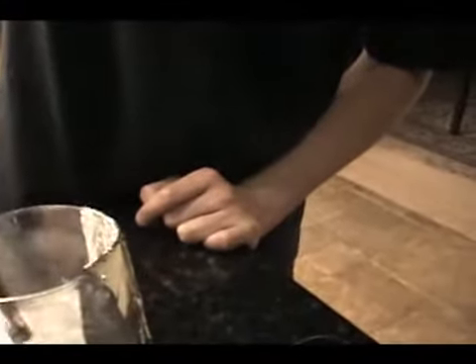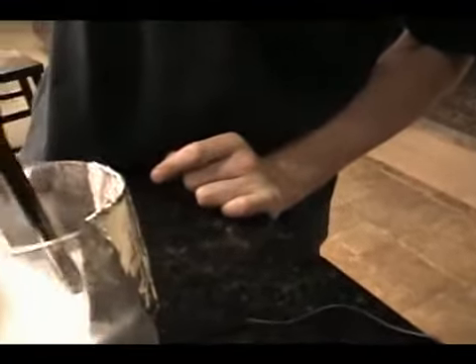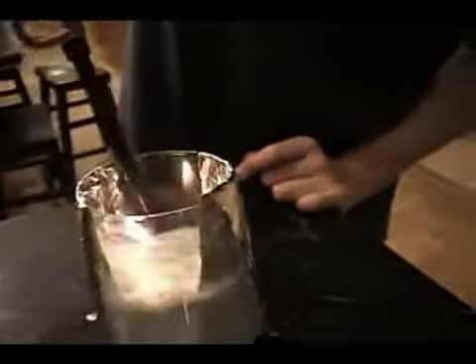Talk about the popping. The popping noise is showing that the hydrogen is in fact burning and combining with oxygen to create water.